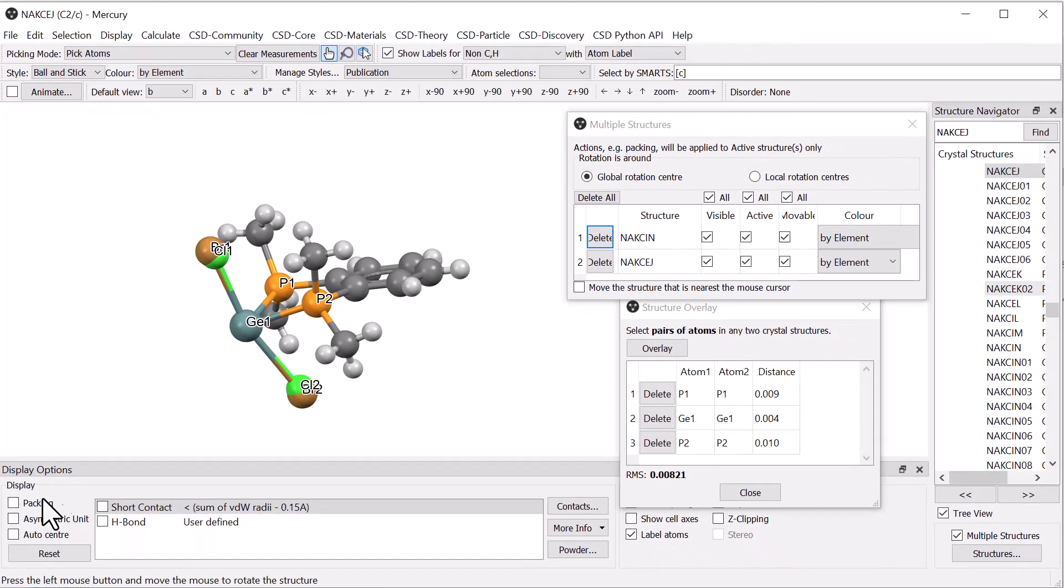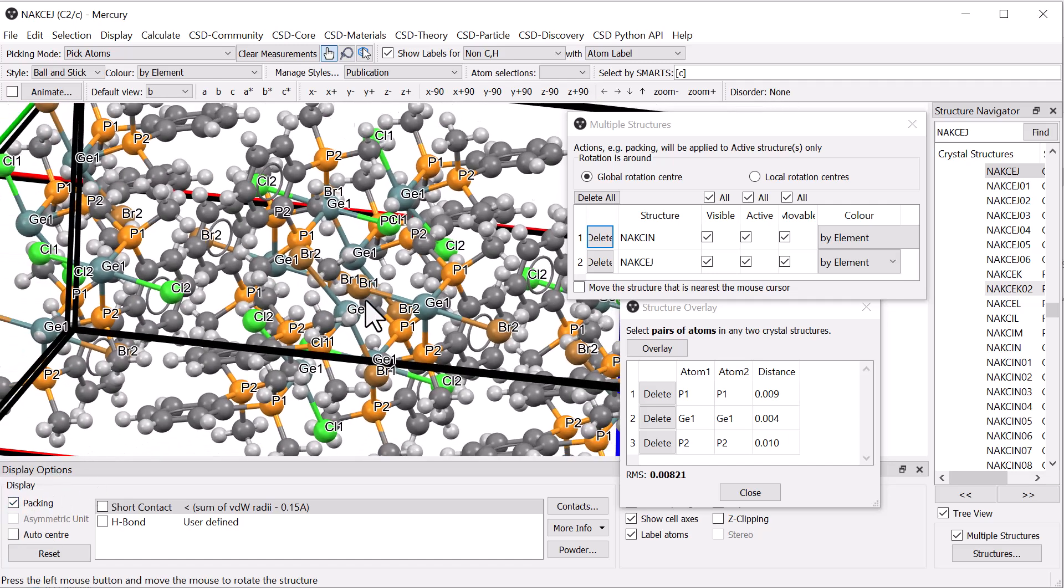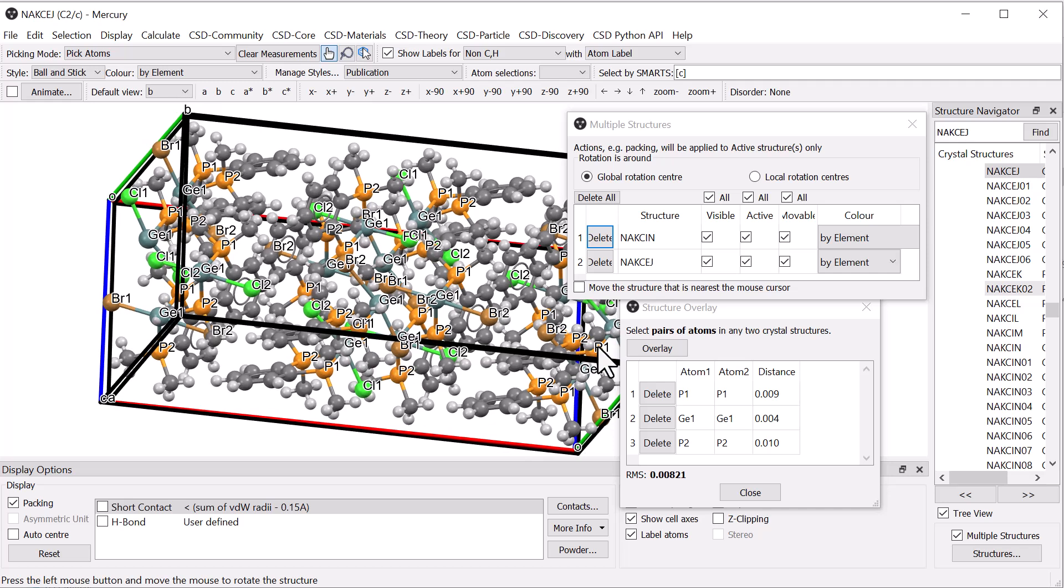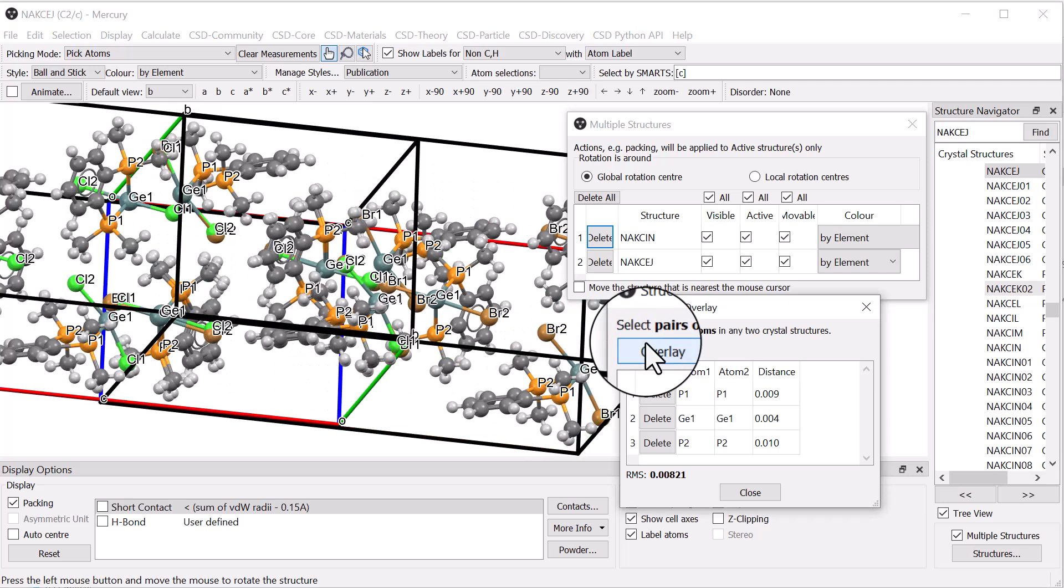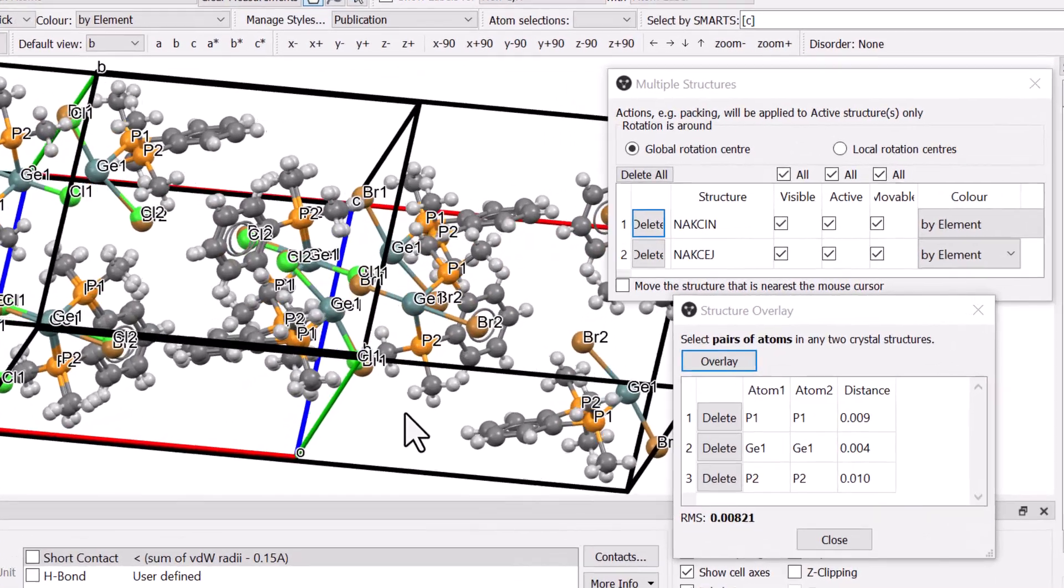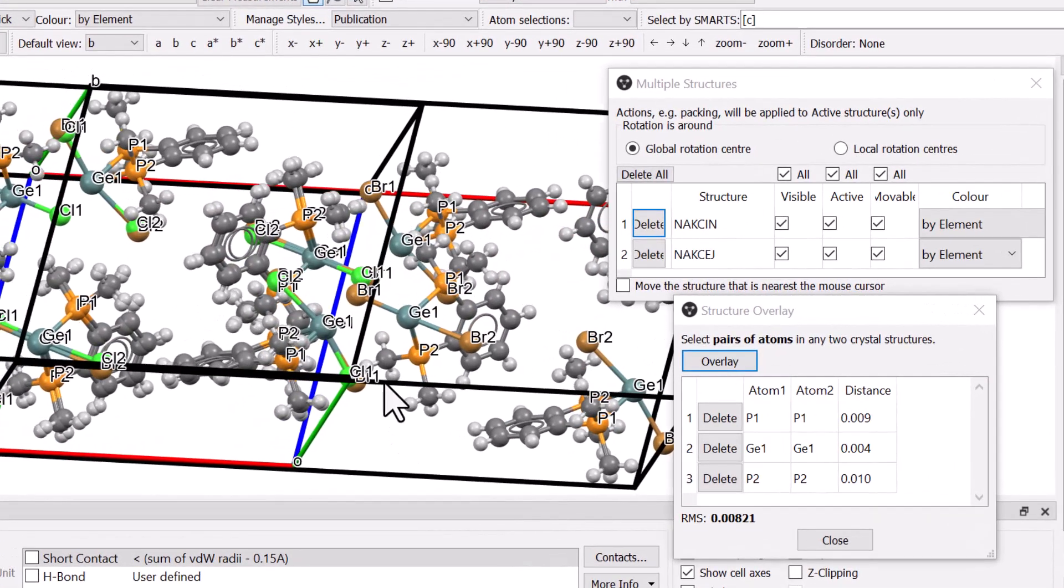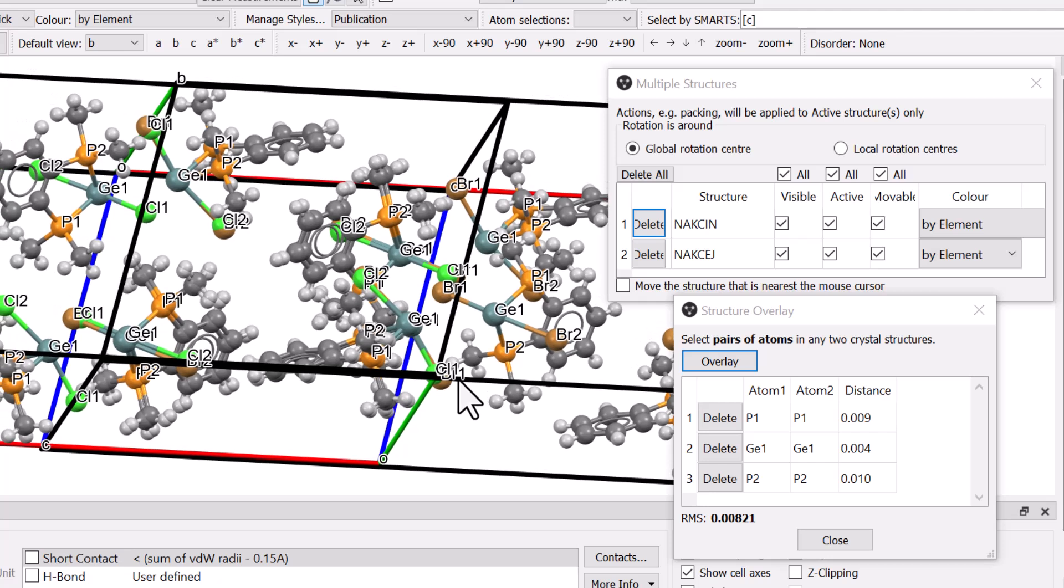In the Display Option toolbar, tick Packing to view the unit cell contents. Click Overlay again to superimpose the packed structures. You will see that the remaining pairs of molecules are also quite well matched, based on our comparison of a single pair of molecules.